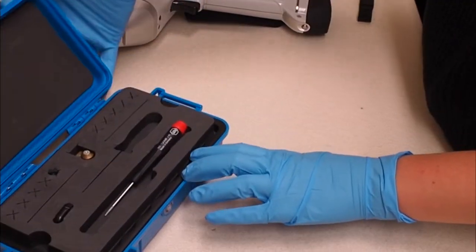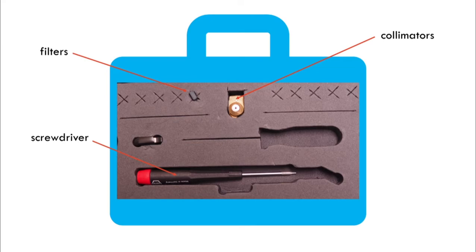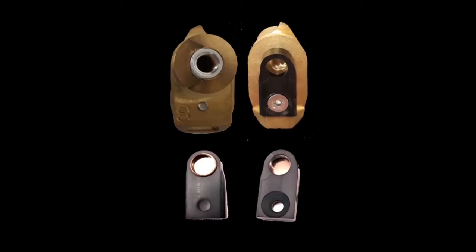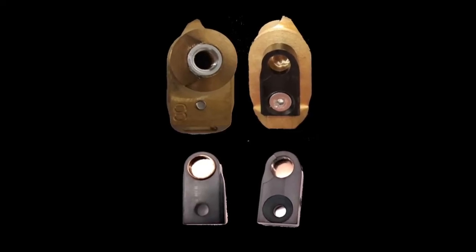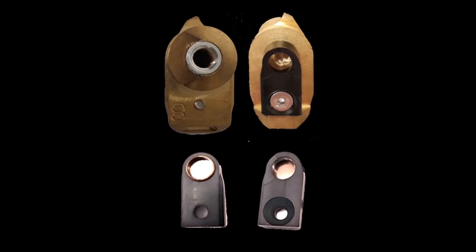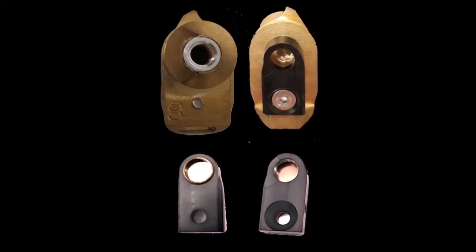The small blue accessories box contains collimators, filters and a screwdriver. Before powering up the instrument, you should consider which collimator you need based on the required spot size and whether any filters are required.